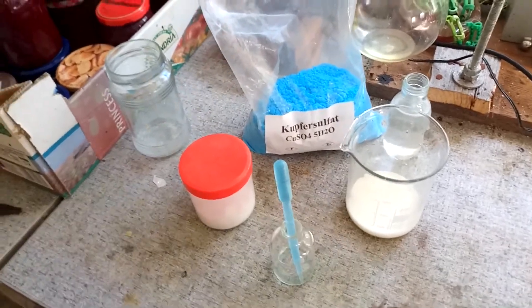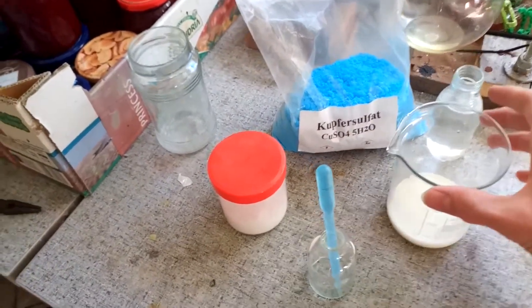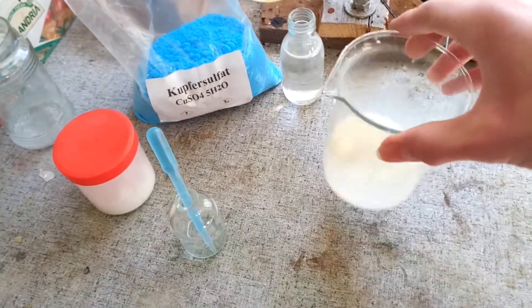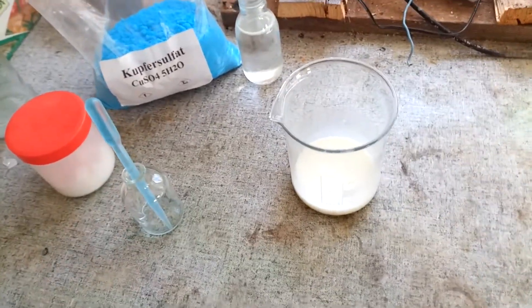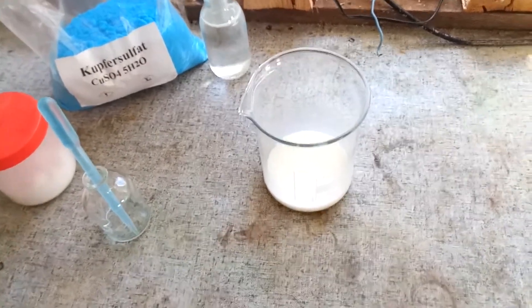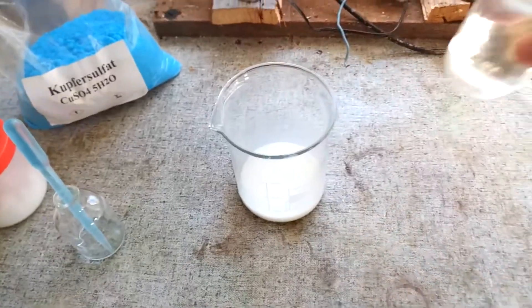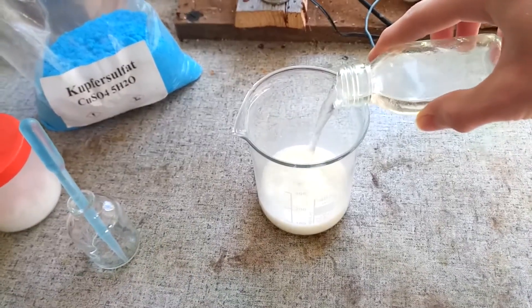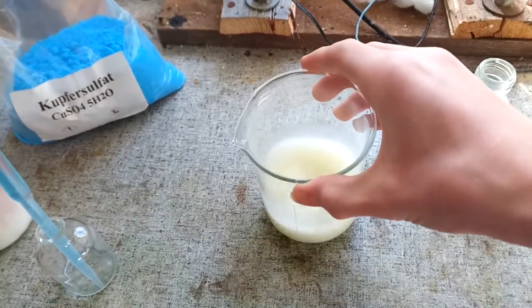The way you do the Biuret test is you take some of your favourite source of protein — in this case it's some milk, actual cow's milk. And you basify it with some dilute sodium hydroxide solution. This is 1% sodium hydroxide, just kind of basifying that.